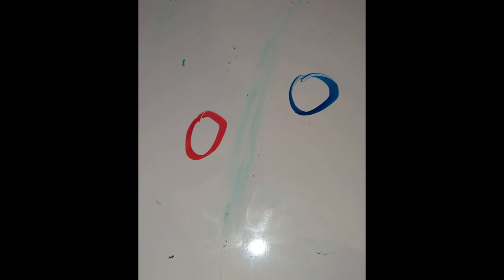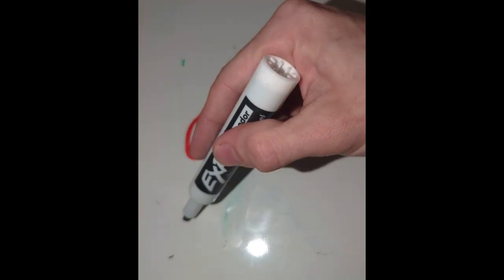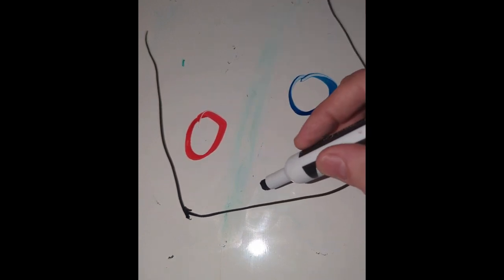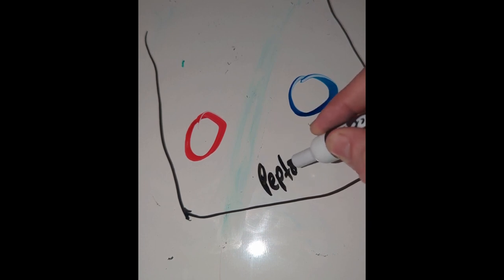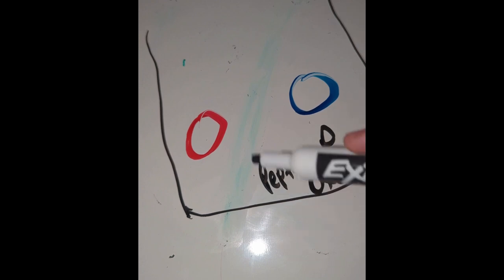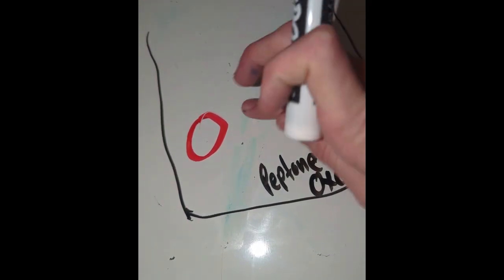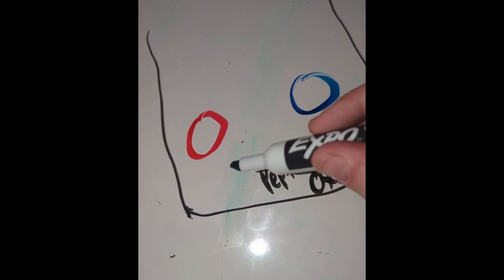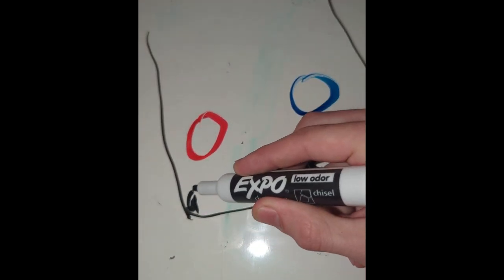And we did this in a glucose solution with Peptone P. So this is a solution that we blended the mycelium in, and it contains Peptone P, otherwise known as oxoid. And shout out to Julian Matucci, hopefully I'm pronouncing that right, for popularizing this concept. Hopefully I'm explaining it well enough. After you've blended your dikaryotic mycelium culture in the Peptone P solution, which also contains a percentage of glucose, I believe.